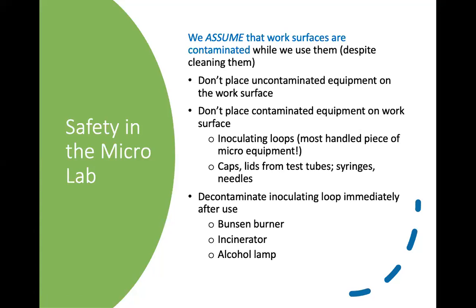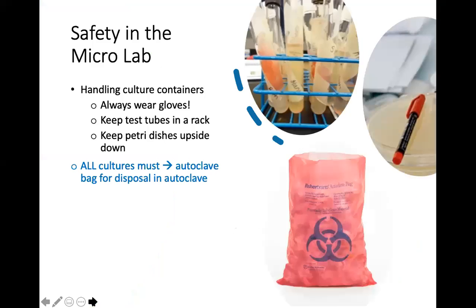Always assume that a surface is contaminated while you're using it, even after you disinfect it — treat it as though it's contaminated. If you are holding something sterile and you don't want it to get contaminated, don't put it down. Keep it in your hands. Your inoculating loops, for example — if you've just sterilized your loop in the incinerator, don't put it down on the desktop unless you're planning to sterilize it again before use. Keep caps, lids, syringes, needles that are sterile in your hand as you're preparing to use them. The tool we use most often in a microbiology lab is that inoculating loop — that wire with the loop on the end and the metal handle. We use this to move microbes around, so it's a constantly potentially contaminated item, and we're constantly sterilizing and re-sterilizing it — either with a Bunsen burner or with an incinerator.